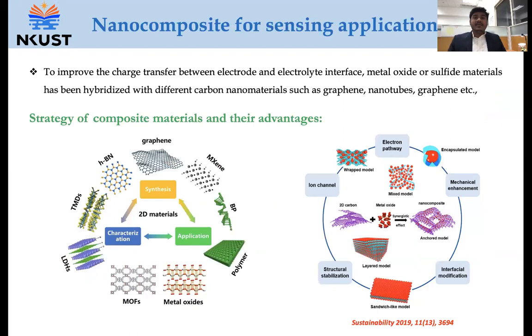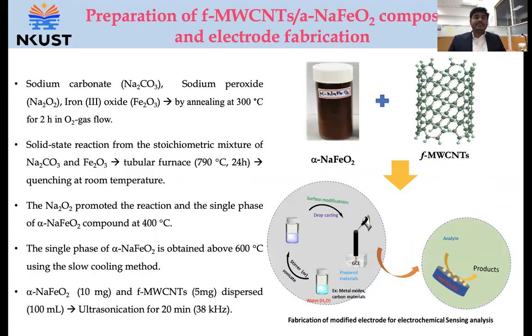Here we can see the composite formation for sensing application. When carbon material is combined with the metal oxide, the synergetic effect enhances the sensing performance. This is the strategy of composite material formation for sensing application.